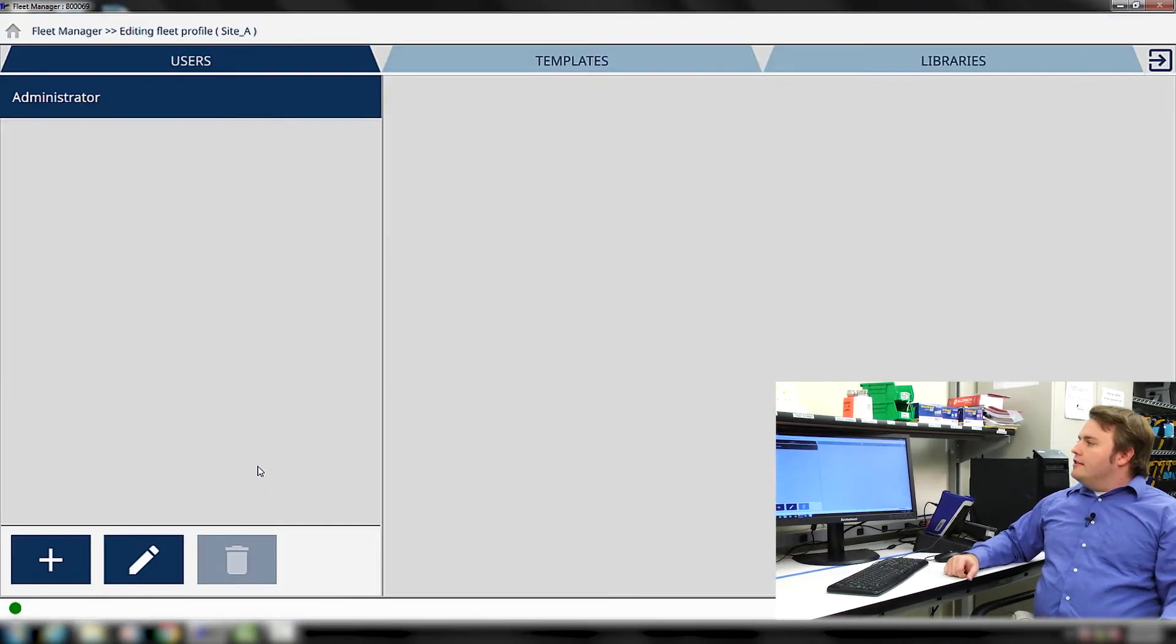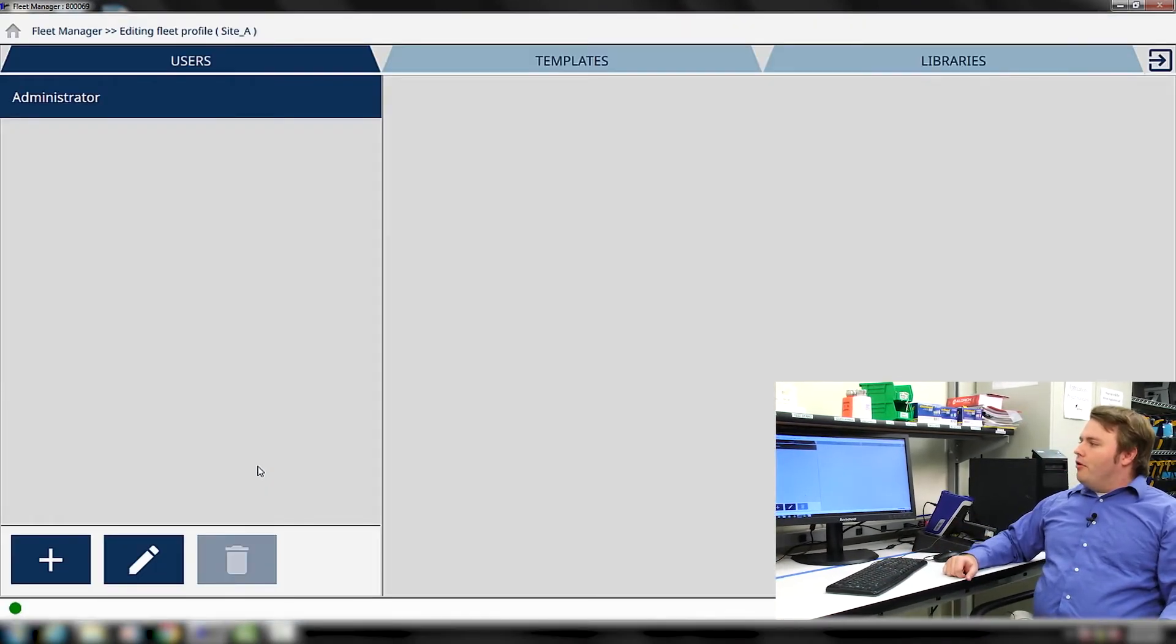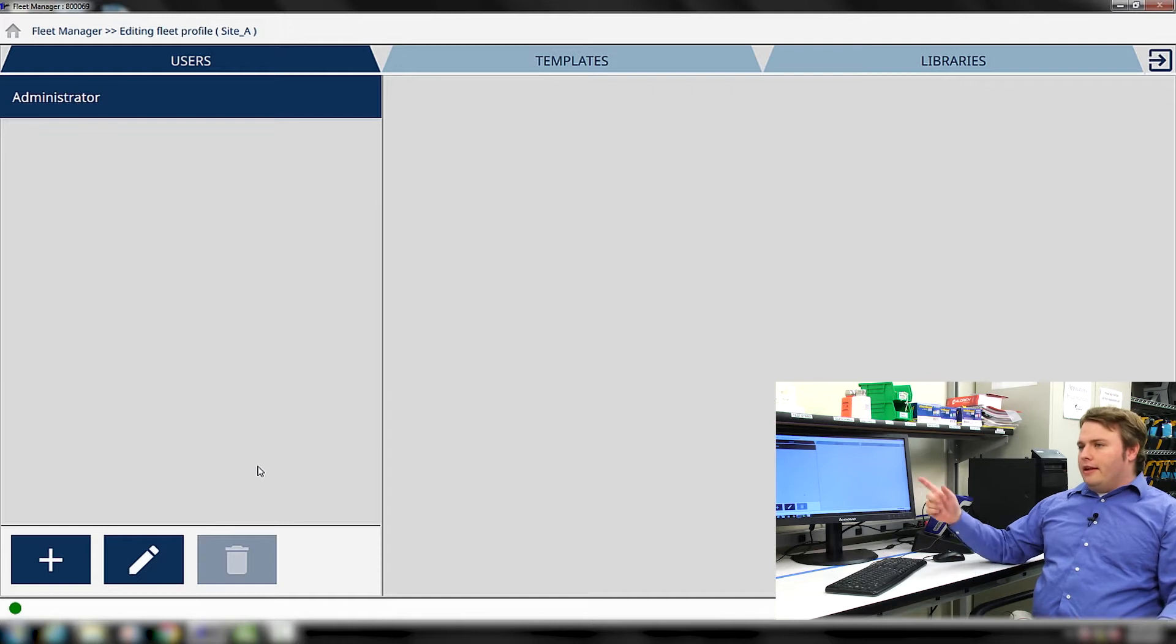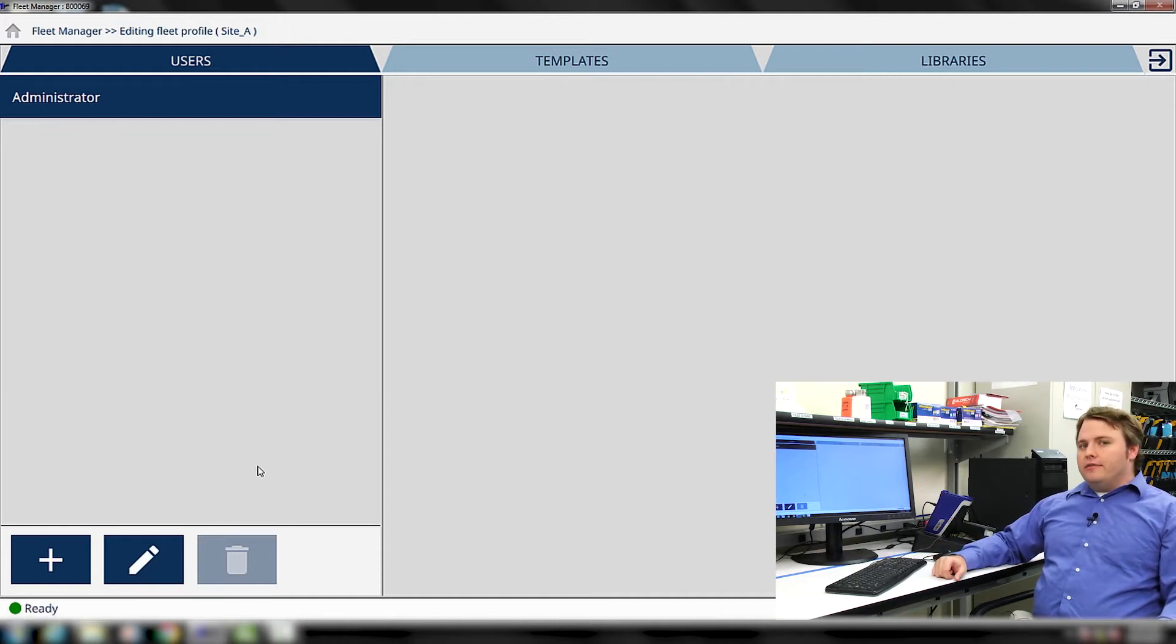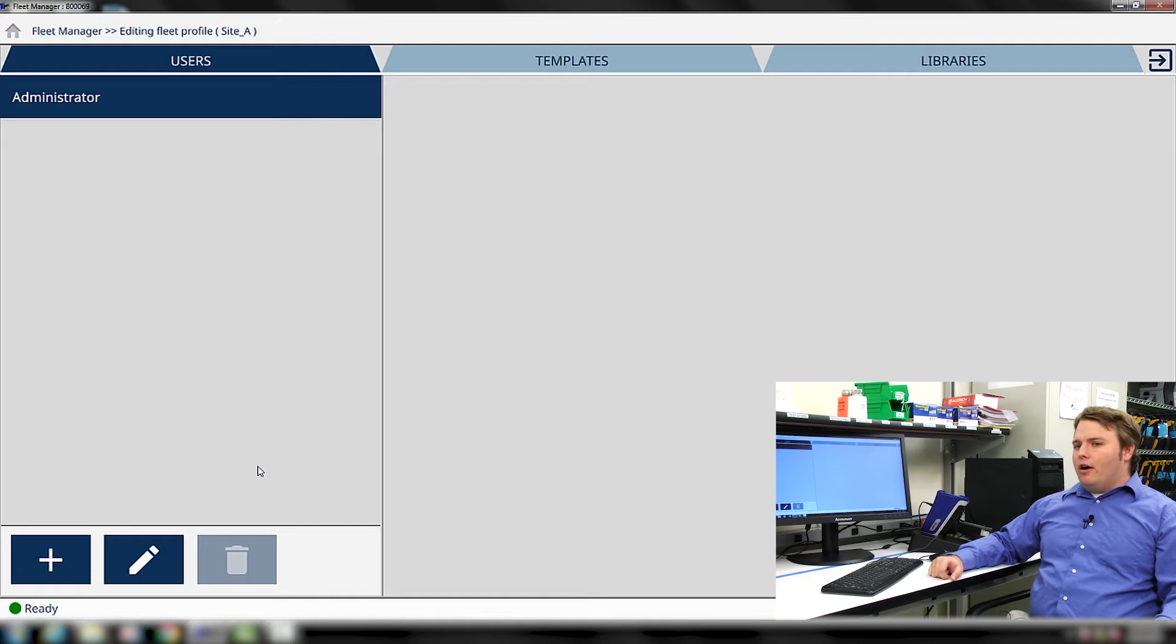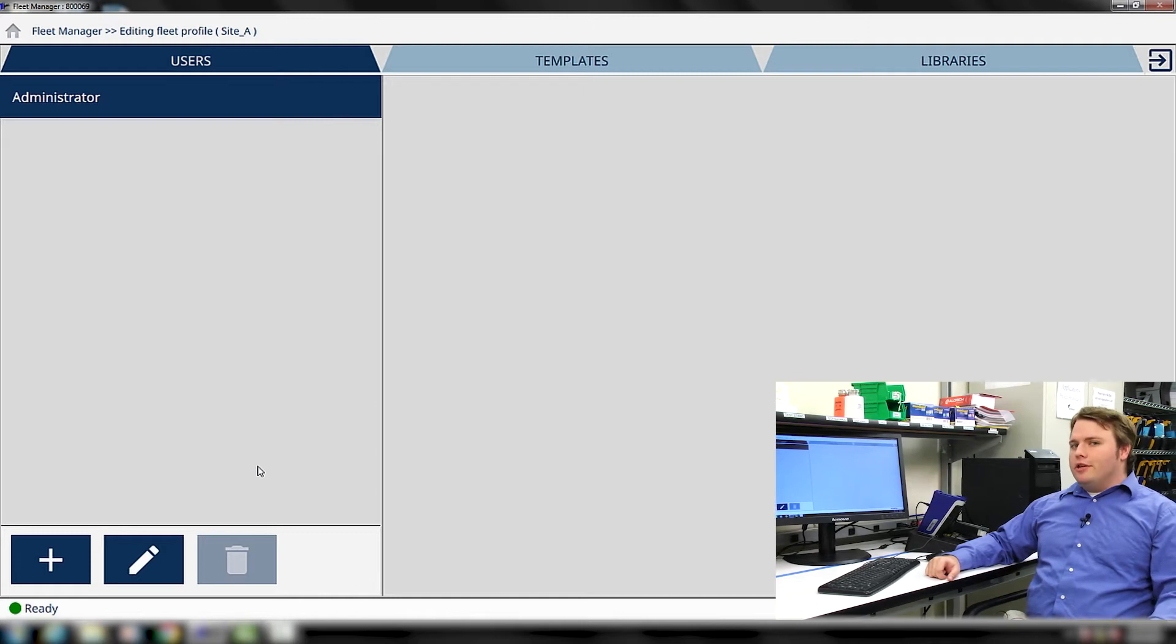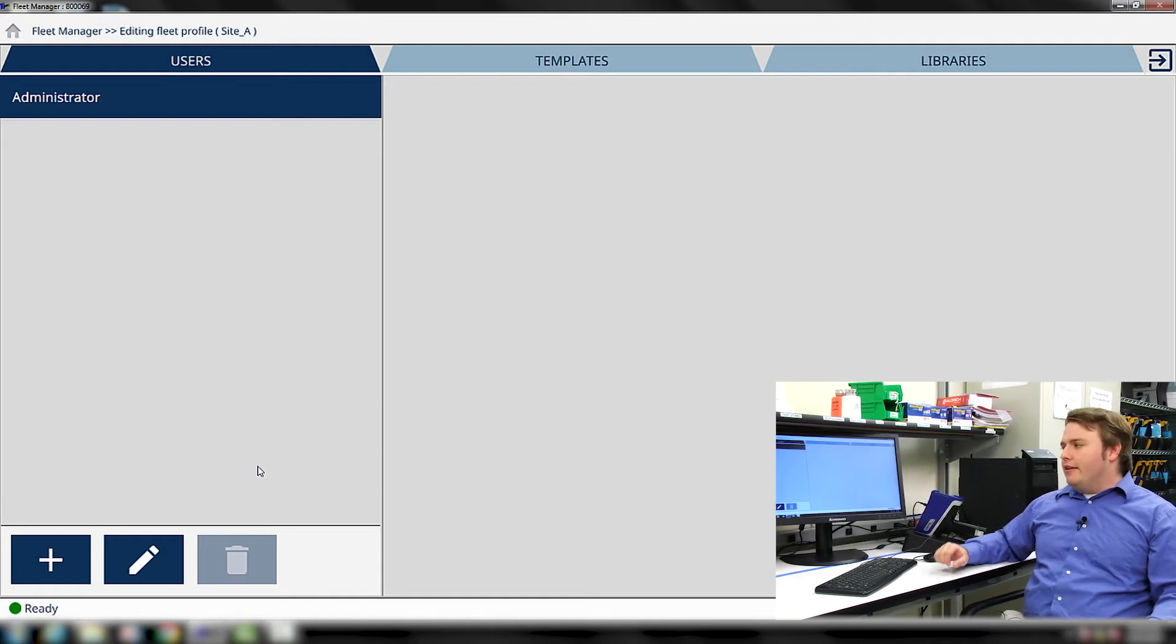You can see the available users for the new Fleet Profile in this left tab. You'll always have the administrator as available for a particular Fleet Profile, but we're going to create a new user called Alice.